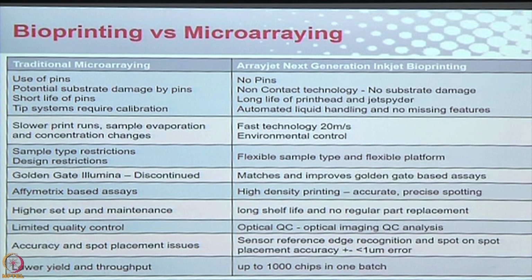So what am I going to do? I'm not going to have 1000 slides which all the antibody is missing. It's a waste of my experiment. So what it does, it remembers that antibody 12 is missing. It will go back and print antibody 12 to all the 1000 slides in case you've forgotten to put the antibody or it has missed.